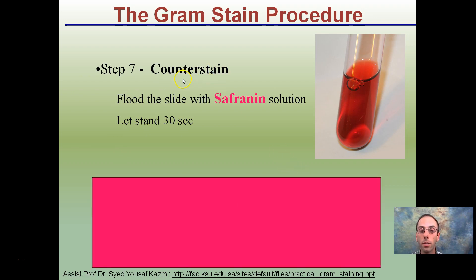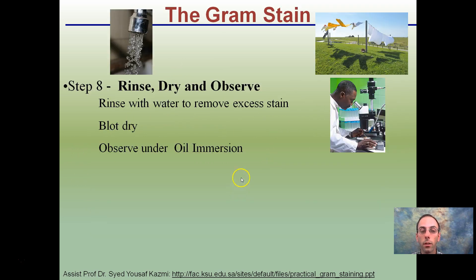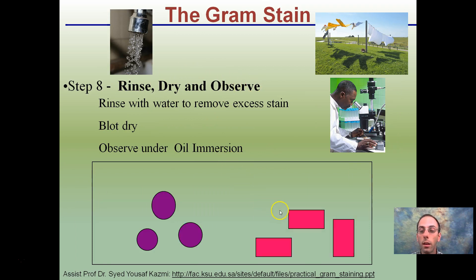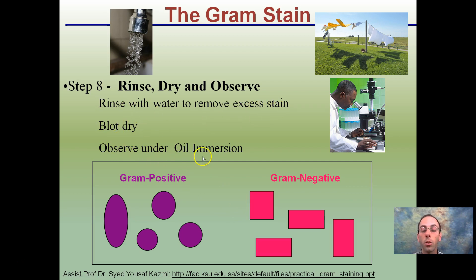Step six: counter stain with safranin solution, a very deep red solution. Pour this over the slide and let it stain for 30 seconds. The safranin stain takes those cells that don't have any color and binds lightly — those are our gram negatives. We don't want to let it sit too long or it will interfere with the crystal violet of the gram positives, which is why timing is important. Then rinse with water to remove excess stain, blot dry, and observe under oil immersion on the microscope.